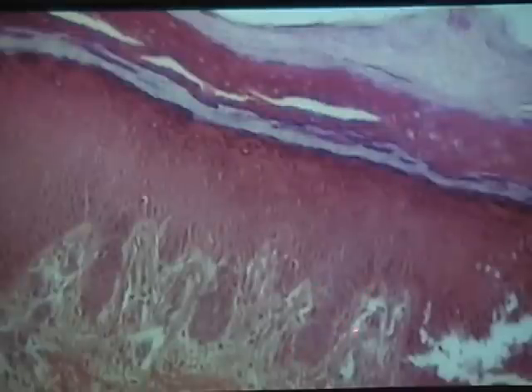And so everything above the area I'm indicating is the epidermis of the skin. The free surface of the epithelial tissue is up here, and actually it may be a little above that. Okay, so the epidermis extends all the way up to here. This doesn't even look cellular, does it? Now, this is low magnification. We'll increase the magnification in just a moment.